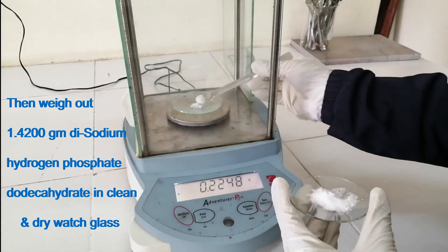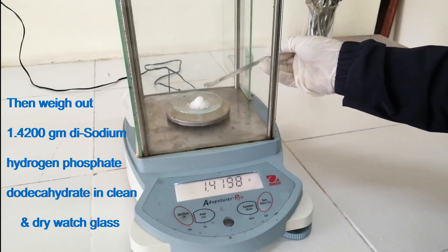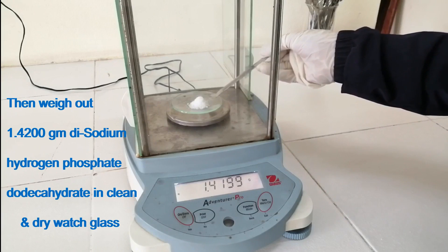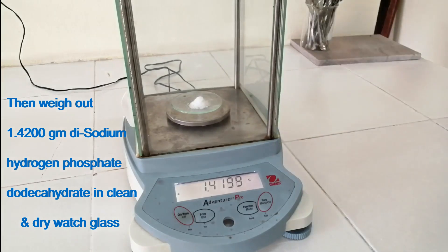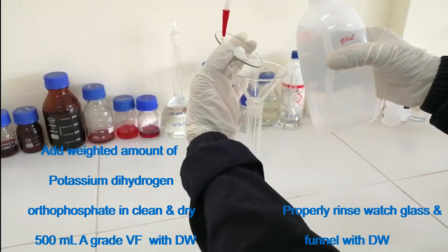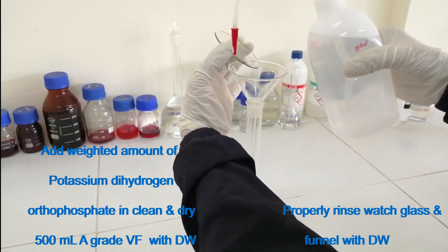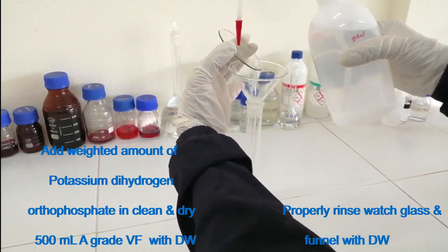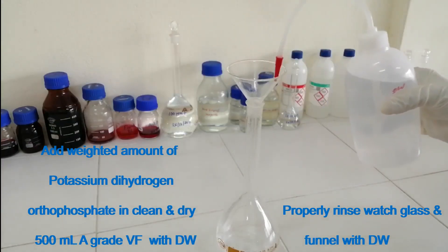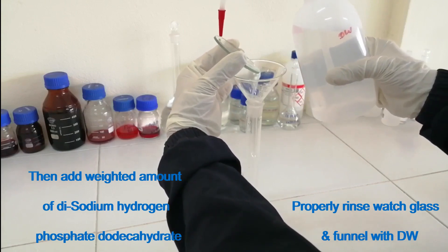Take a 500 ml A-grade volumetric flask. Add the weighed amount of potassium dihydrogen orthophosphate into the clean and dry 500 ml A-grade volumetric flask with distilled water. Properly rinse the wash glass and funnel with distilled water. Then add the weighed amount of disodium hydrogen phosphate dodecahydrate.